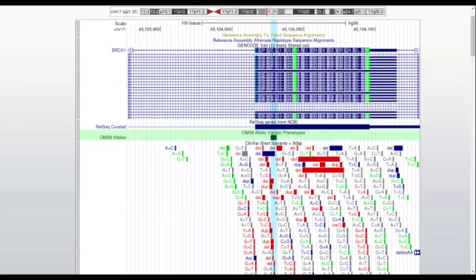But by using UCSC, you have some defaults, easily turned on and off. Which one do you guys prefer? Do you want to start from scratch and do one by one to generate your figure, or start from all the information there? It depends on your purpose. That's the major difference between IGV and the UCSC Genome Browser.